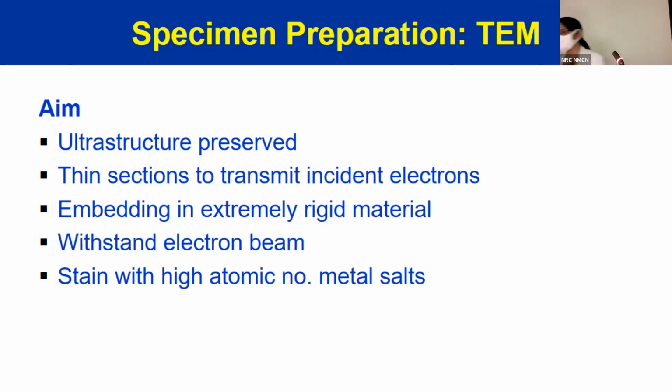So what is the fixative that we use for electron microscopy? Okay, so basic sense that it keeps the ultrastructure preserved, right? But when you take it in glutaraldehyde, we keep the tissue in the refrigerator as compared to light microscopy where we never keep the tissue in the refrigerator. We have to keep it at room temperature. Why? Because the penetration power of glutaraldehyde is very low. So if you keep it outside, the tissue will get autolyzed. So that is why we take it in glutaraldehyde, and if you do not send it to the lab immediately, you are asked to keep it in the door of the fridge.